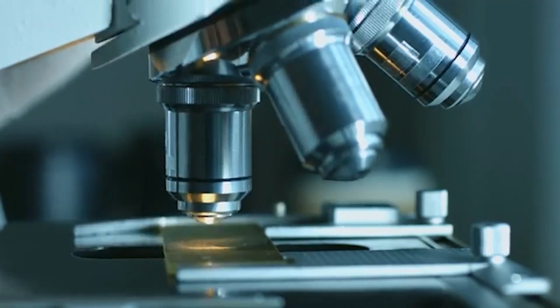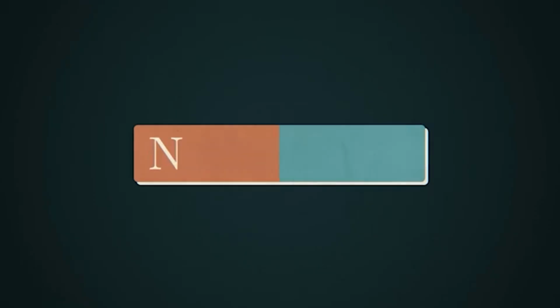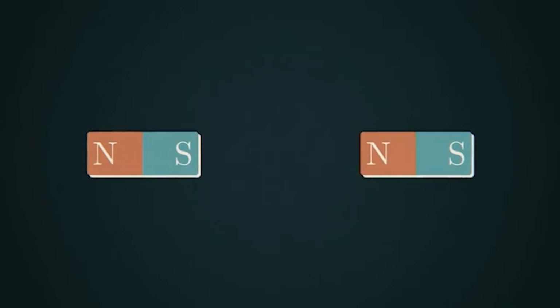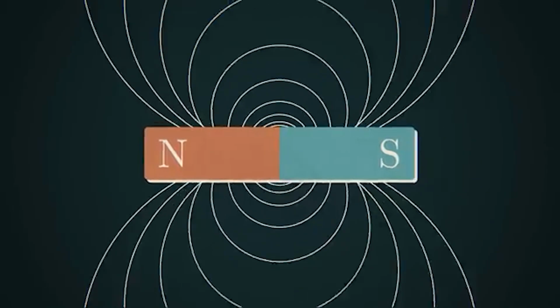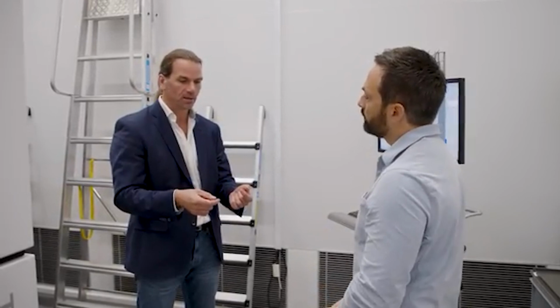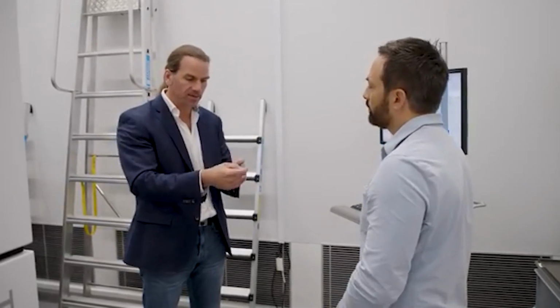So you might imagine that the TEM simply needs its own version of a diverging spherical lens to magnify further. But with magnets, this is physically impossible. Every magnet has two poles, a north and a south. It's impossible to just have one. Even if you split a magnet down the middle, it creates two smaller magnets, both with a north and a south. And all magnetic field lines have to start at one pole and end at the other, forming a closed loop. This is a direct result of the second Maxwell equation, because the field that you create has field lines that start and end at the same magnet.